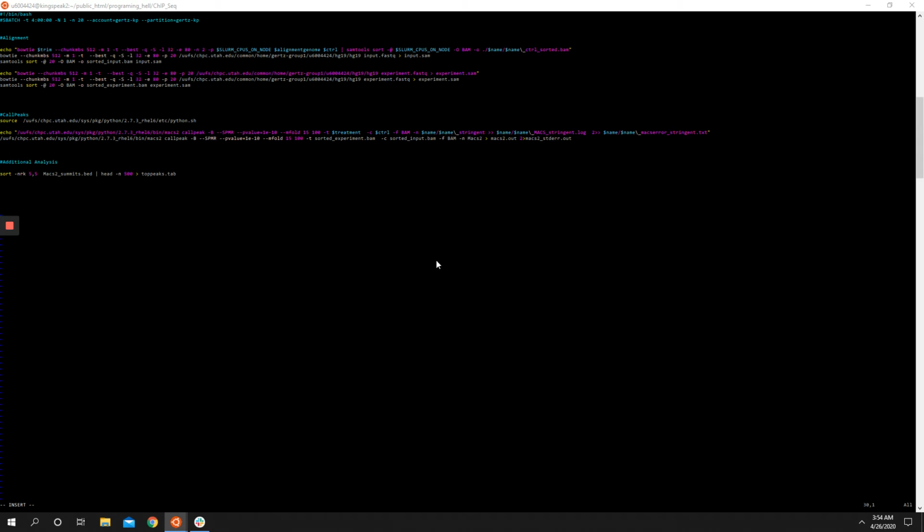So what we want to do is go then into the genome and pull this out. I've got an older version of this program, and a newer version that I'd like to use, but we're just going through this real quick.